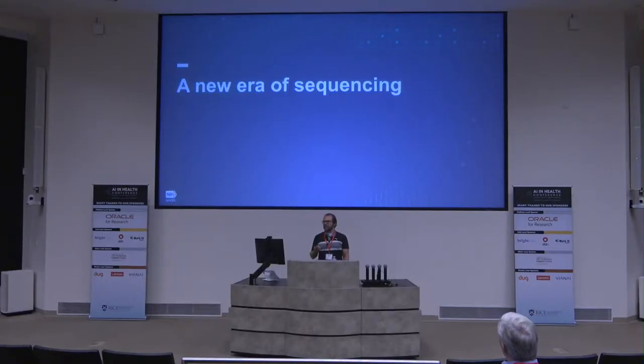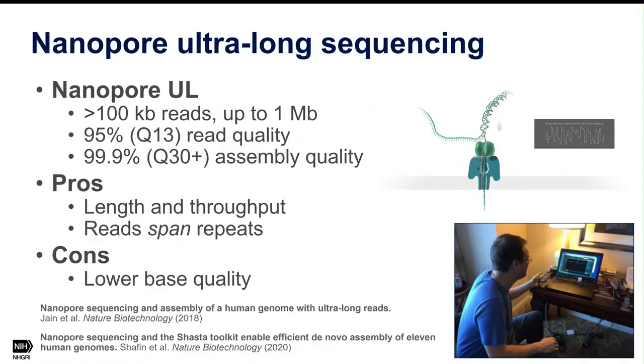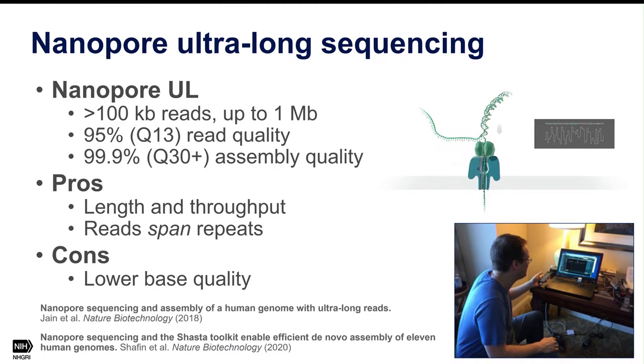So what enabled us to do this now? Well, we've been fortunate, like Todd alluded to in his introduction, to work in this new era of long-read sequencing. There are two primary long-read technologies right now. One is nanopore ultra-long sequencing. This is a really cool instrument. The picture here shows our collaborator sequencing in his hotel room at a conference. He did the library prep in the coffee maker, using the hot water to do the PCR reaction and then prep it, and the instrument fits in the palm of your hand.